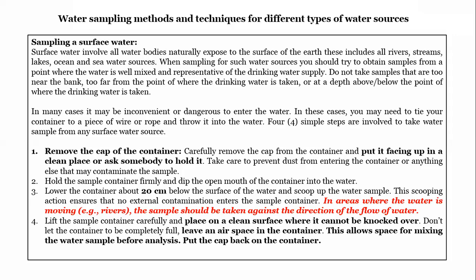The second step now is hold the sample container firmly and dip the open mouth of the container into the water. So this is how you do it. But the third step goes further to describe the fact that it must be 20 centimeters.